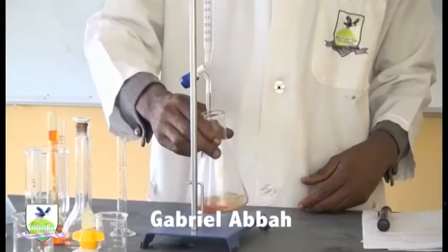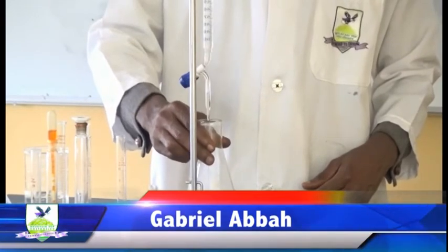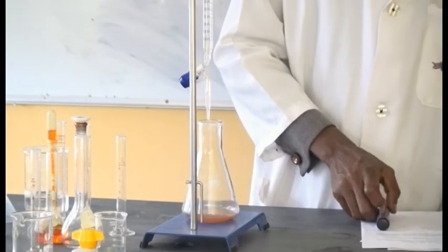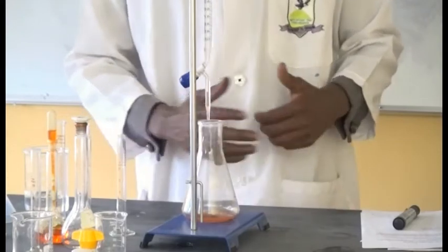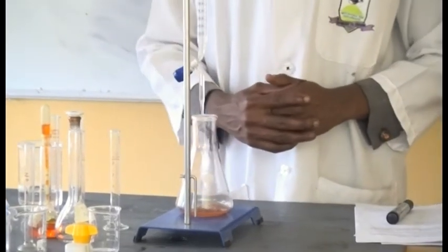Yes, so we've gotten it. Now we're going to leave it to stand for one to three minutes. If the color persists within this period, then the reaction has taken place. At that point, we take our reading.